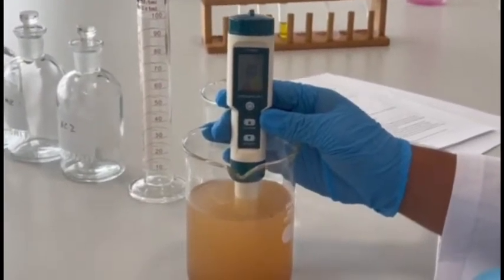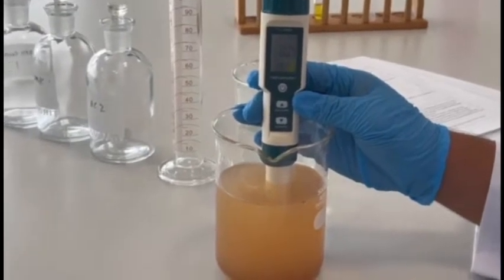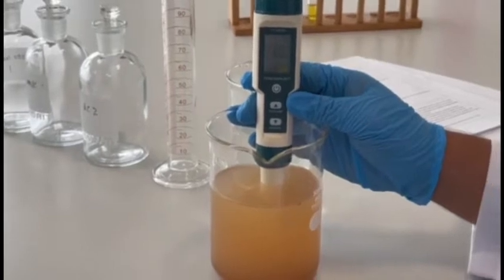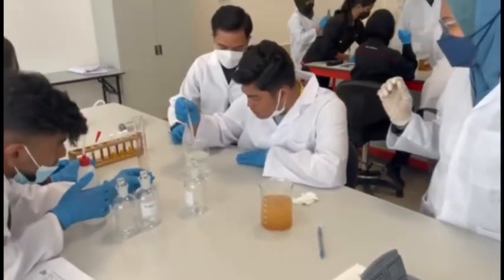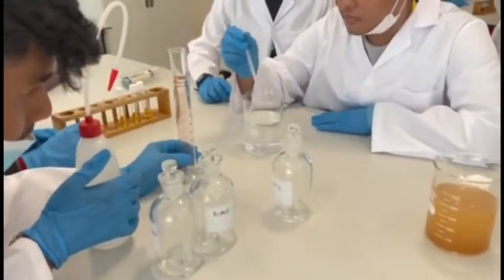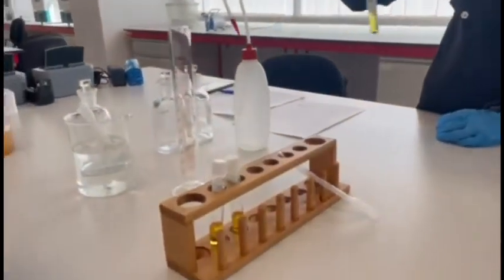Place the vial in the preheated DRB 200 reactor. Close the protective lid and heat for 2 hours. Turn the reactor off. Wait about 20 minutes for the vial to cool to 120 Celsius or less. Invert the vial several times while still hot. Number 9. Place the vial into the rack to cool to room temperature.